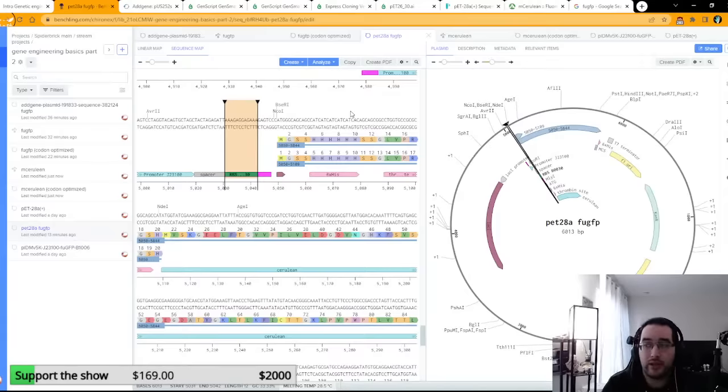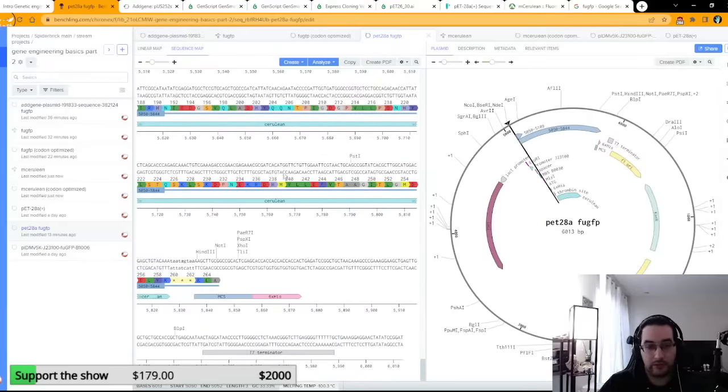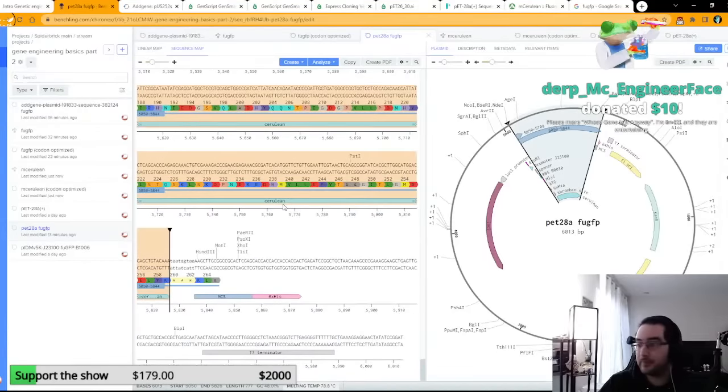The only other one that I've used is AlphaFold. We have an instance of it running on our server at the lab, and that's really helpful. It's something that I'll show in a stream at some point, but AlphaFold is the closest thing to a compiler that there is. If I had AlphaFold running, I could just copy this from there to there.